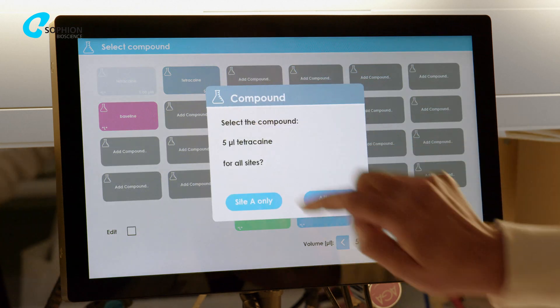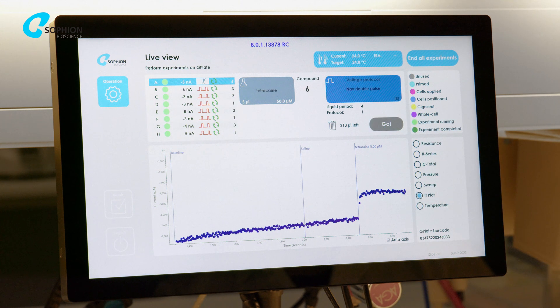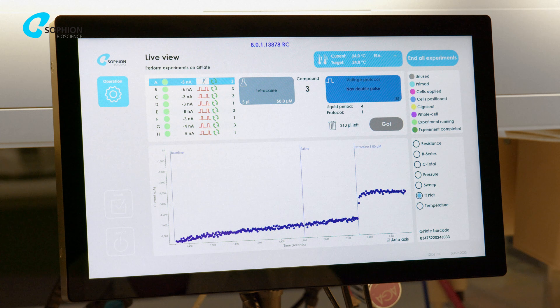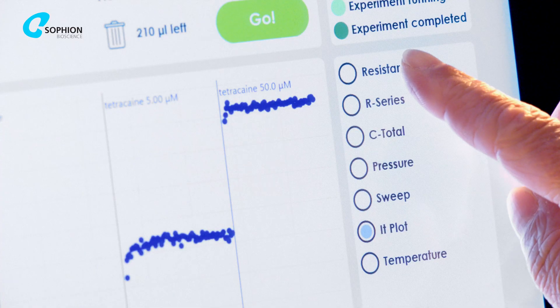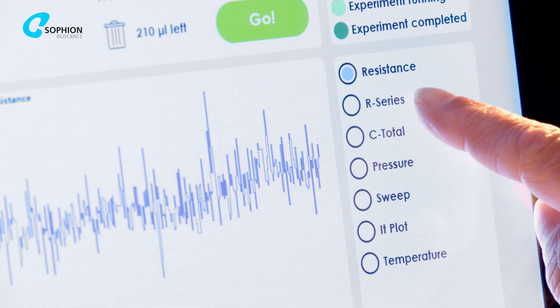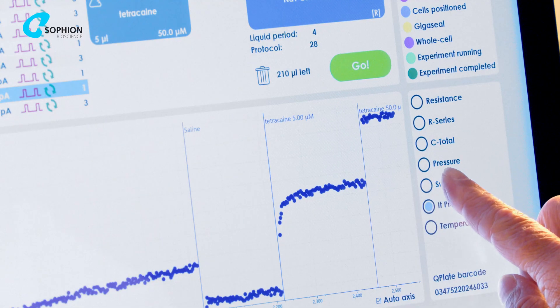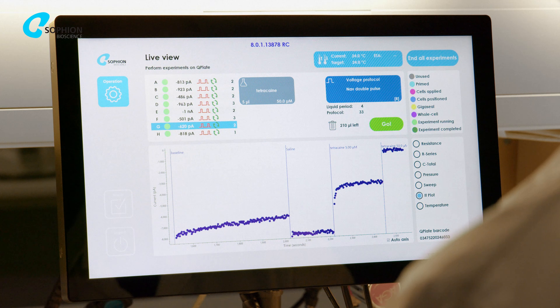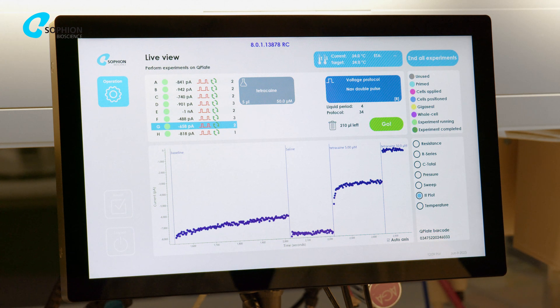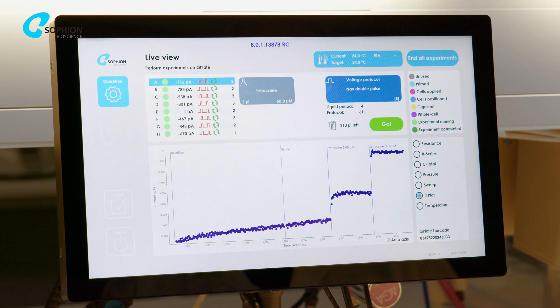Select your next compound or concentration and press the Go button. The countdown and the light guidance will indicate when to add the appropriate liquid. Qpatch Compact records the current measured after adding the compound. You can view cell parameters such as resistance, pressure and capacitance in real-time simply by clicking the buttons on the right-hand side of the screen. If online cursors have been added when setting up your voltage protocol, you can also view the IT plot as the experiment progresses. You can repeat liquid additions and apply different voltage protocols as many times as needed whilst the recording integrity remains intact.